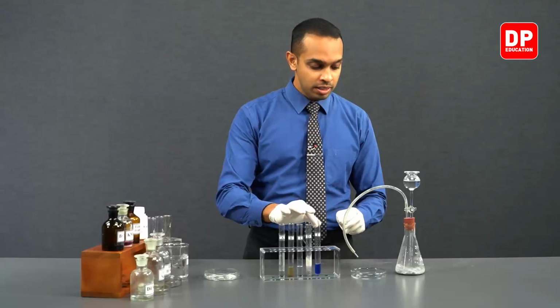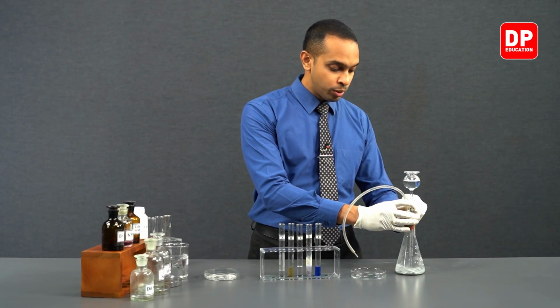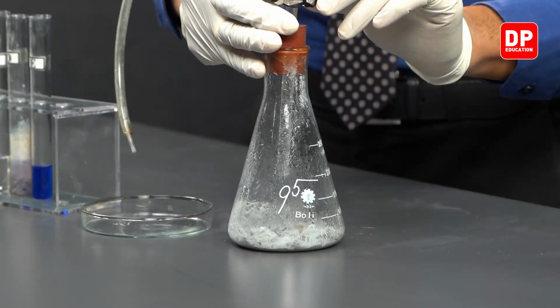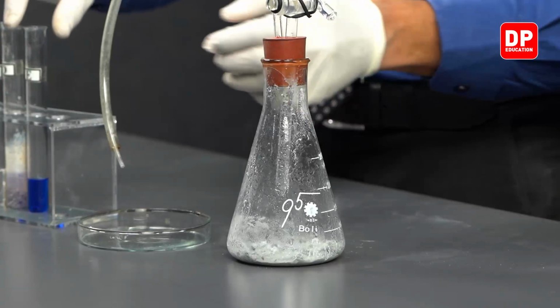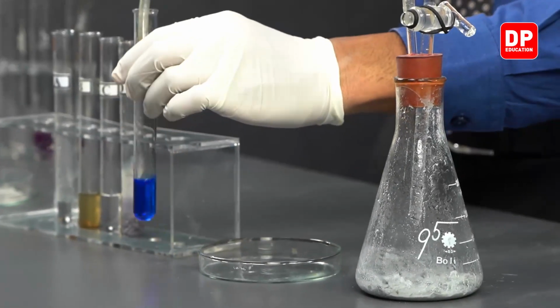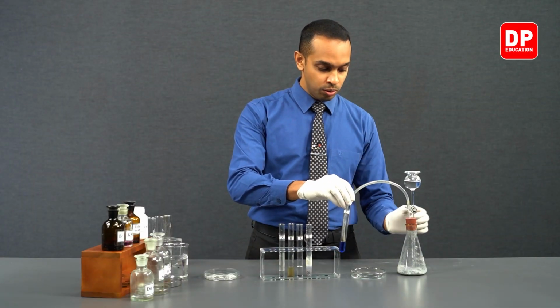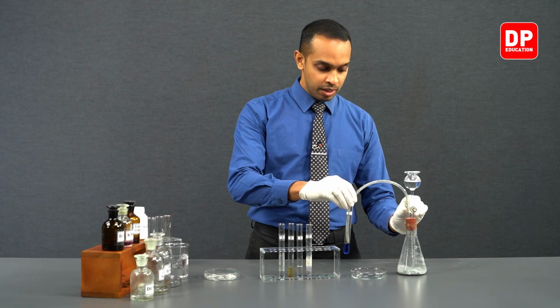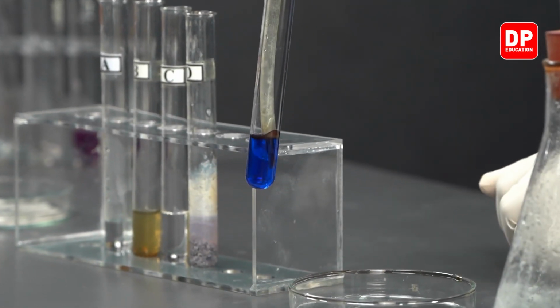So let's allow some water to come into contact with calcium carbide and produce acetylene gas. And as acetylene gas gets produced, we will insert this delivery tube into our ammoniacal cuprous chloride solution we have here.